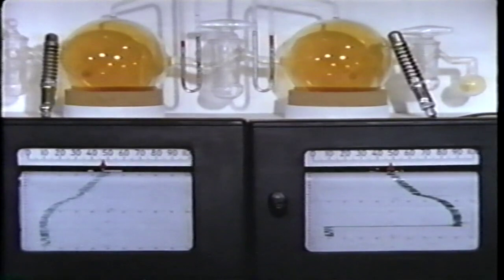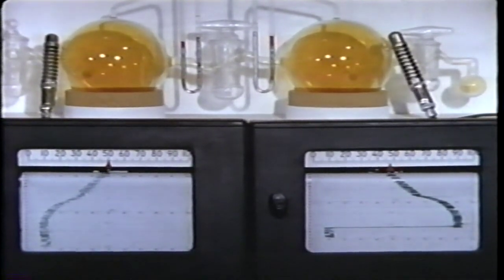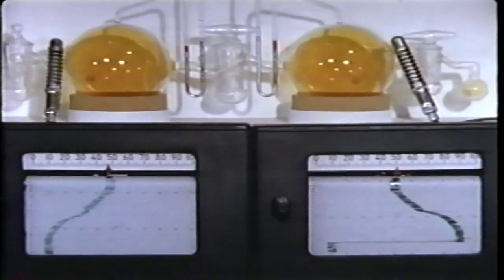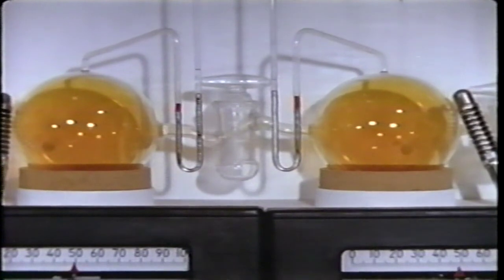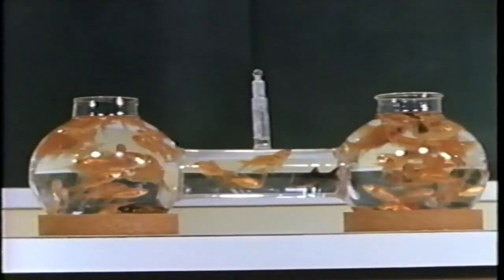Apparently, those gas molecules containing radioactive bromine nuclei are moving from the right bulb to the left. Since pressure is constant, molecules must be moving in the other direction also. It is clear that molecules move back and forth, even though color and pressure remain constant. We see that pressure equilibrium is explained in terms of dynamic molecular behavior, just like the fishbowl equilibrium.